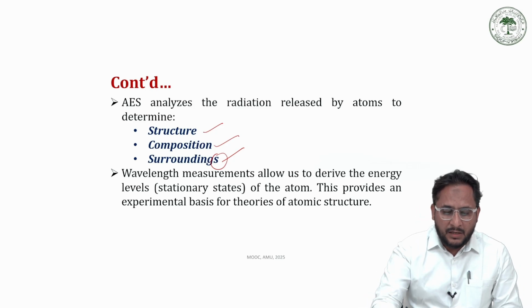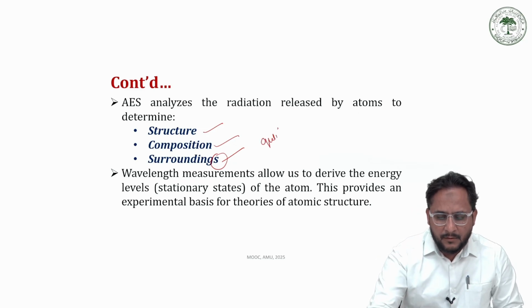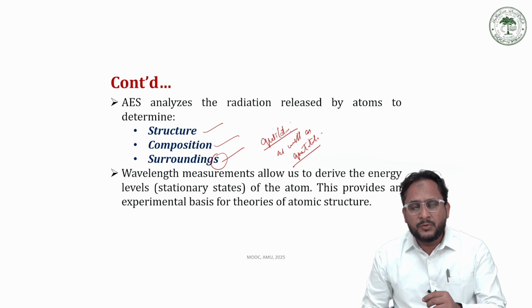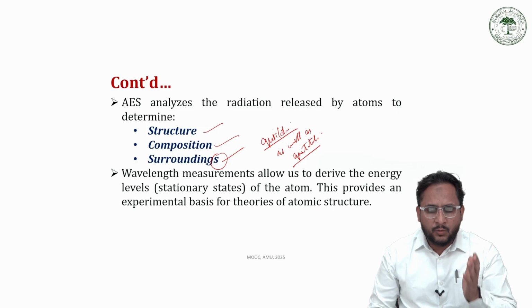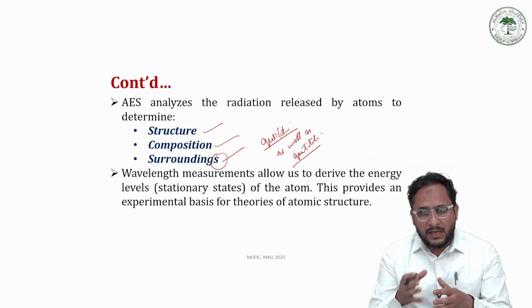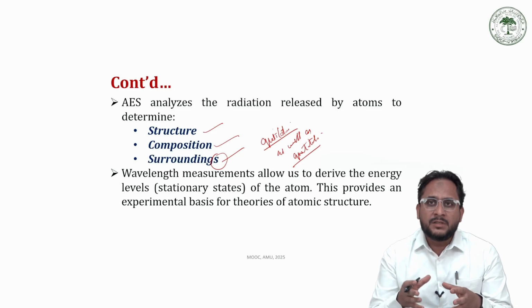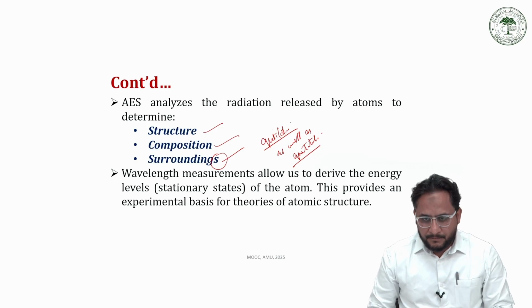Again, this technique is used for both qualitative as well as quantitative analysis. Just like atomic absorption, atomic emission can also be used for qualitative as well as quantitative analysis. Once again, I would like to apprise you that qualitative means to know the nature of the compound, its structure, its type and behavior, while quantitative analysis means to determine its amount or concentration in the given matrix.